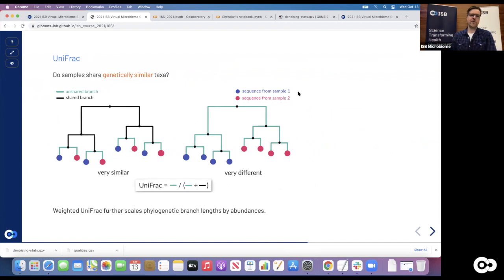And if I compare, especially within an environment or across different environments, I might also want to take into account that certain organisms can be really close to each other. So you could imagine a case where you get a lot of different amplicons from a single environment, but if you look at those amplicons, they only differ by a single position in their actual sequence. So they're very similar. They look like they might be almost the same organism or organisms that are very closely related. You might want to account for that as well.